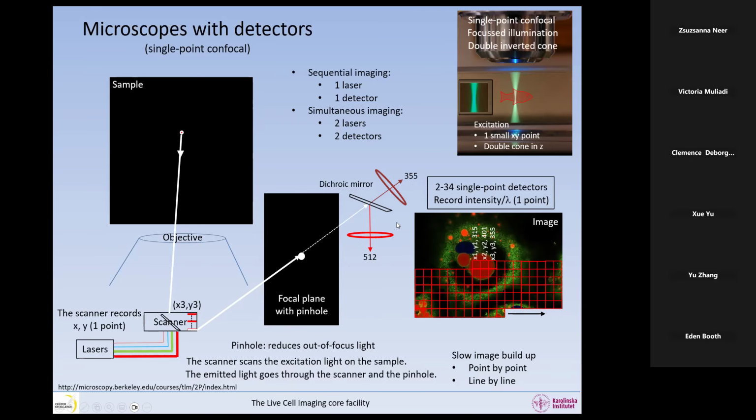And you understand that this is the case where you really want to be very careful because the 2 fluorophores are excited super well. So you want to be very careful that you have no bleed through. Otherwise, you will not be able to see the correct fluorophores in the correct image. So this is what happens when we are imaging simultaneously.